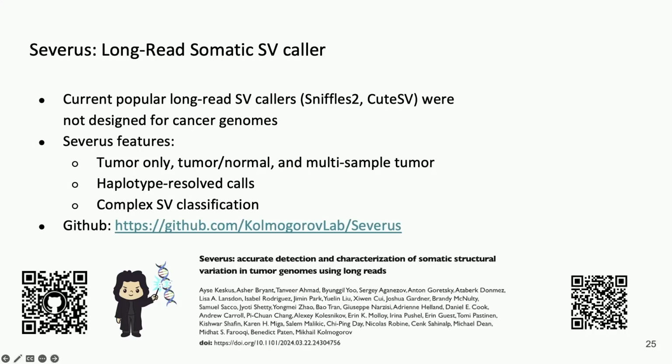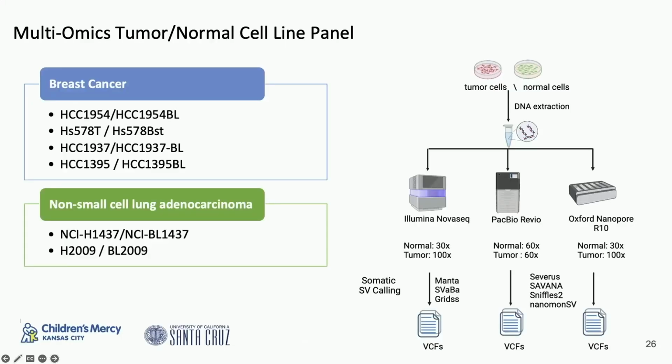The other thing that we know about the cancer genome is that it is unstable and evolving. So most of the events that we observe in cancer genomes are actually complex events that cannot be defined by a single line in a VCF. So in the last step, we cluster structural variations and annotate them. But to start with, building all these steps, we need to be sure that we are calling structural variations accurately. But unfortunately, there is not much data available to test if our tool is working well or not.